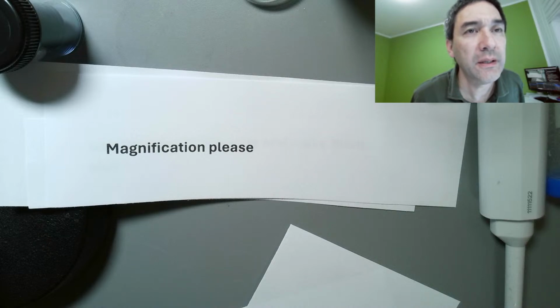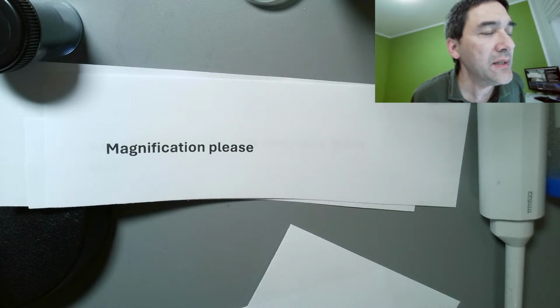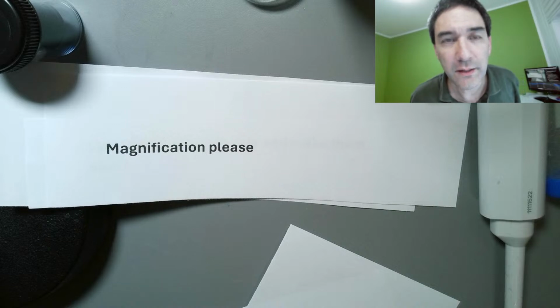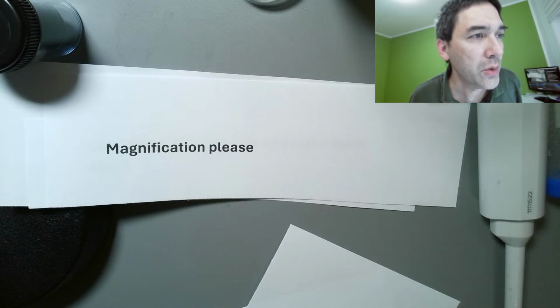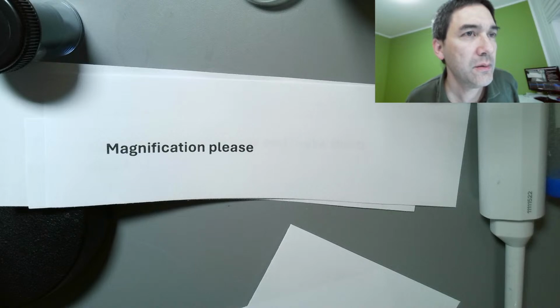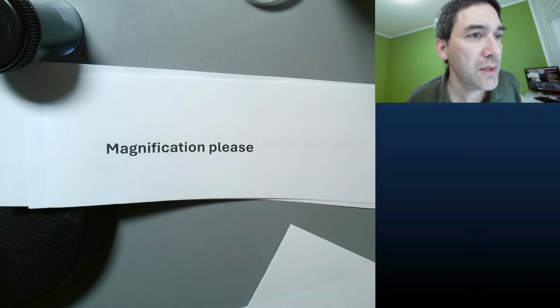So unplug the camera and plug it in again or remove it. Yeah, that is something that I also try to do sometimes, but then it might not find it again. You know what I'm going to do is I'm going to try it in any case, because at least we got this one here working. And if the other camera doesn't work, then yeah, for whatever reason. You see, just a second. Yeah, see, it's not visible.